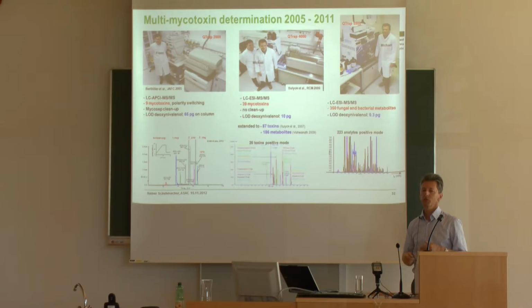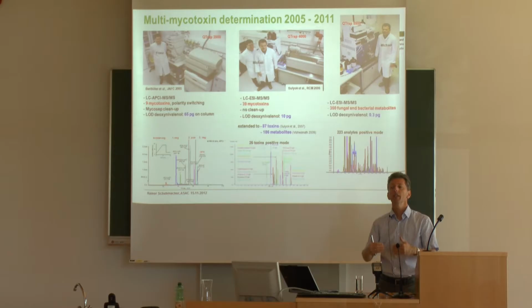And this low LOD, this high sensitivity, is actually also the reason why we are now also able to look into biomarkers, to look into the mycotoxins and their metabolites in the urine, because otherwise that's not feasible without any proper sensitive instrumentation.